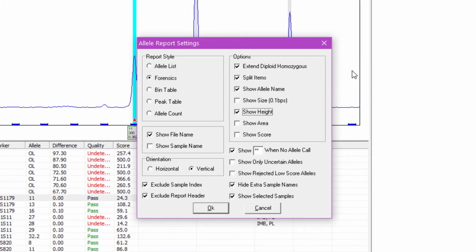These settings are also used for the third and final file type required by MaSTR. This is the signal file for the protocol dataset and the mixture file. This file type consists of allele calls, their peak heights, as well as stutter peaks and their peak heights.